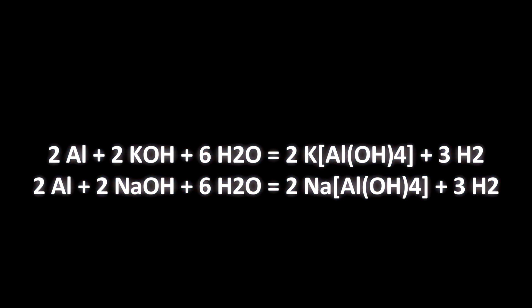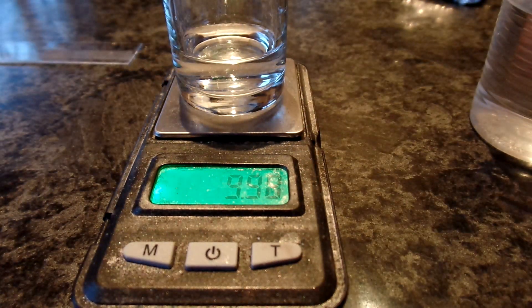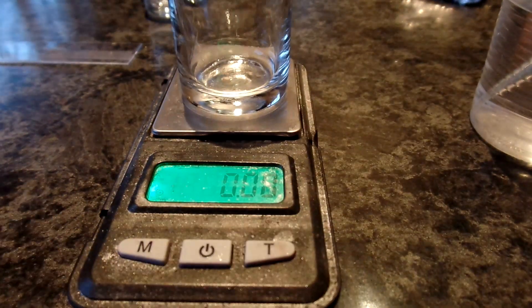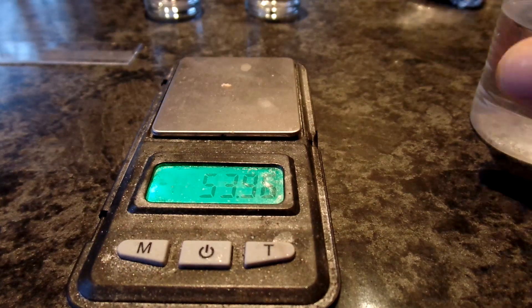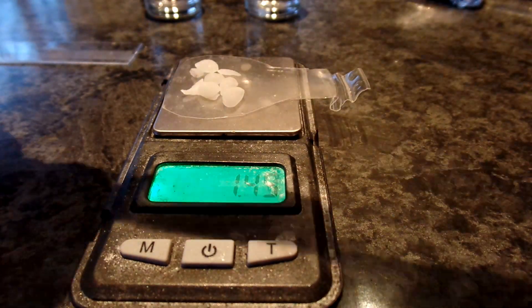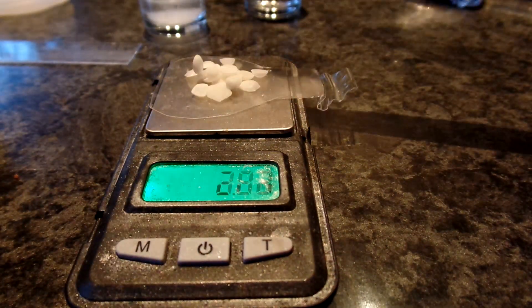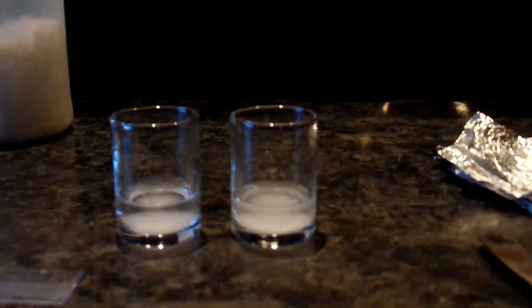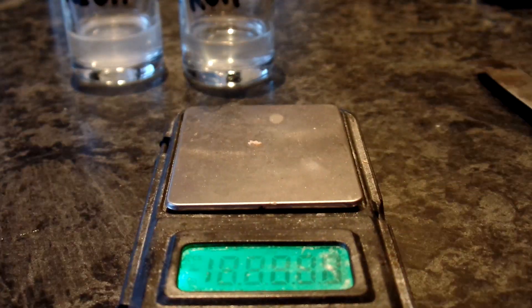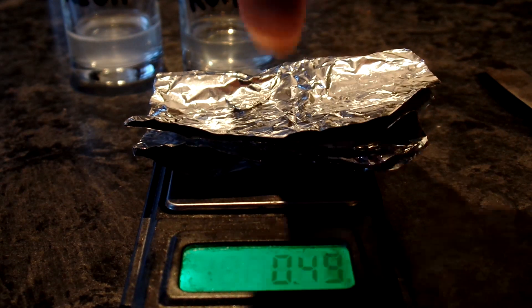First, I will react the same mass of hydroxides with the same mass of aluminum foil in the same amount of water. I take 2 grams of each hydroxide and dissolve them in 10 milliliters of water. I weigh two sheets of aluminum foil, half a gram each, and try to make two identical small balls.